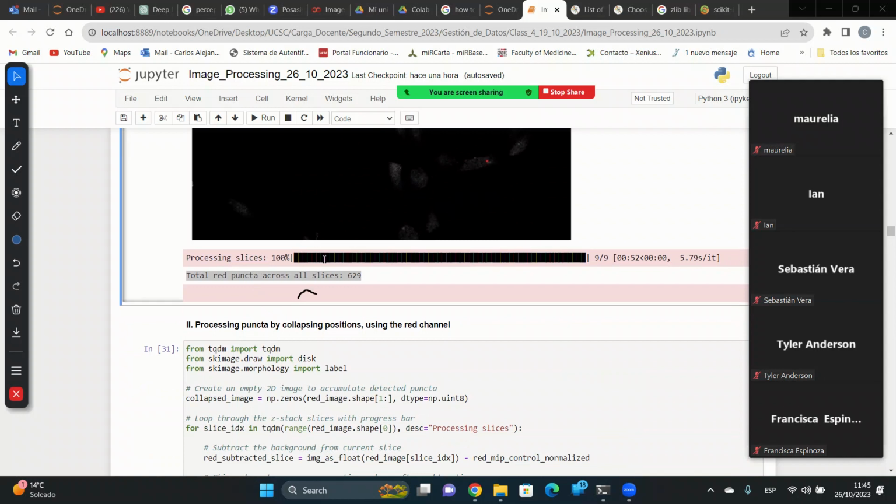Basically, you ask. I usually go to CMA, which is a facility here of microscopy. Say, hey, I have a thicker fish tissue. Can you do a z-stack, but jumping across the whole tissue in order to capture as many features as we can? Or sometimes I just need to quantify fluorescence and I just need to do the very dense z-stack with these cells. Because these are cells, we can collapse positions.